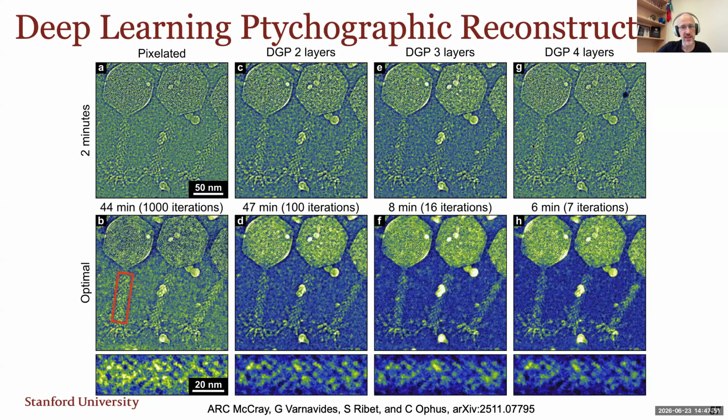And so currently there is still some empirical determination of the best way to do the machine learning here. And so we are working on ways of automating this and giving advice to users, or even directly predicting from the data sets how to do the best possible reconstructions.